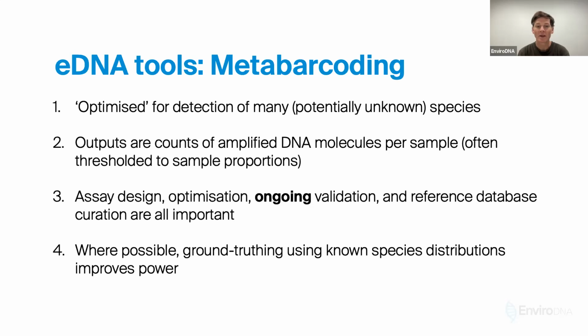It really can be very useful, at least to throw up things that are potentially interesting or potentially wrong. So that will enable you to improve your resolution and also to focus in on things that are, again, interesting or sometimes wrong, because there are many ways in which taxonomic assignment can go wrong due to gaps in the database, unknowns or even known unknowns.